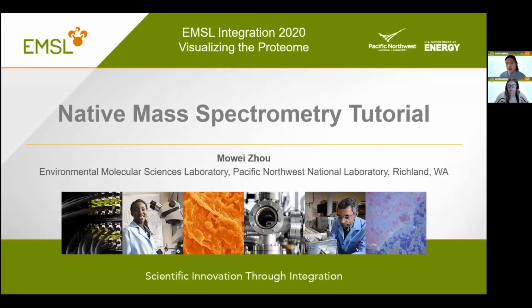So in this tutorial, I'll try to have more of a recap from a high level, a very brief overview of what native mass spectrometry can do, how it can help us understand protein structure and function, and also what capabilities we're offering at EMSL.